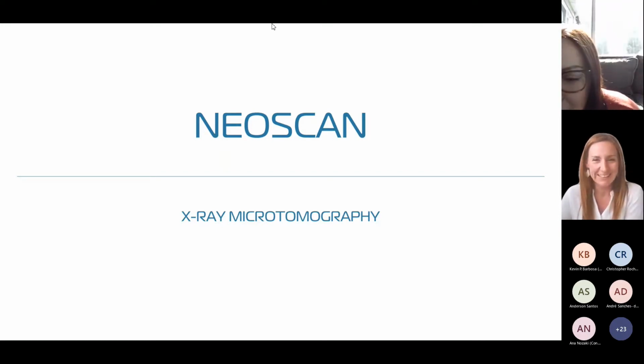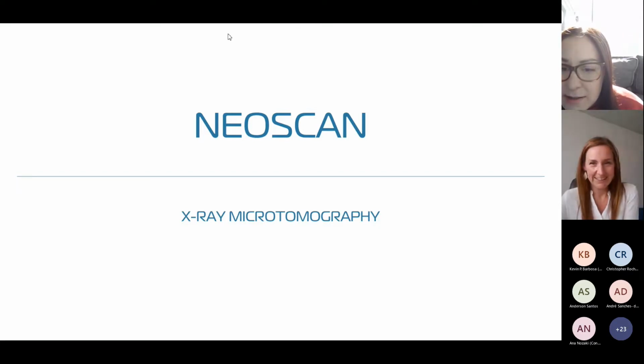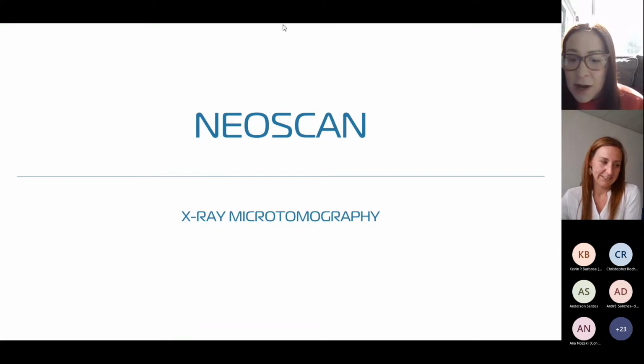Yes, I can read you the questions. Hi Evie, very nice to see you again, working with MicroCT. This is Marco. You talked about free software for visualization and so on. Do you provide software for analysis as well?